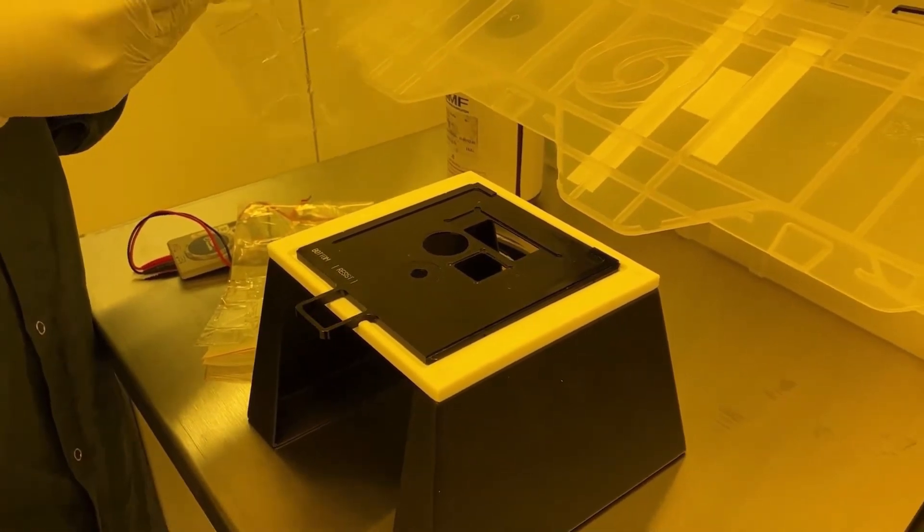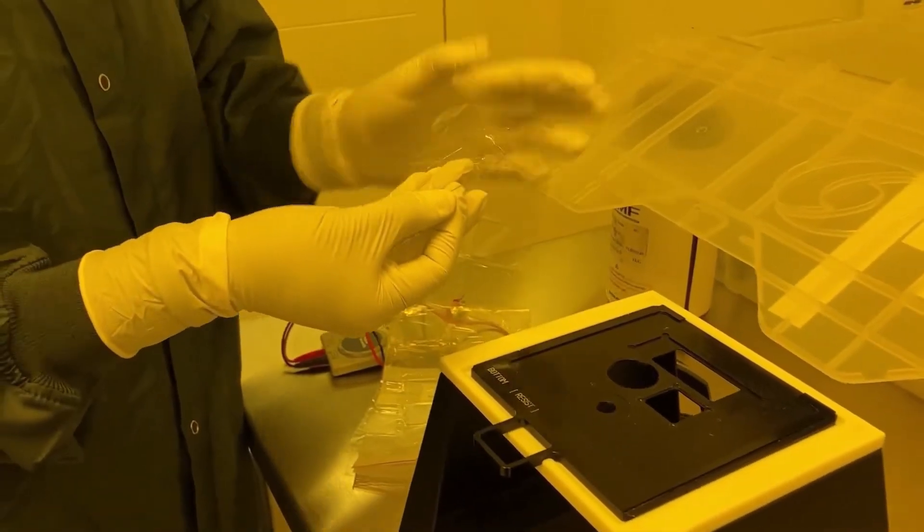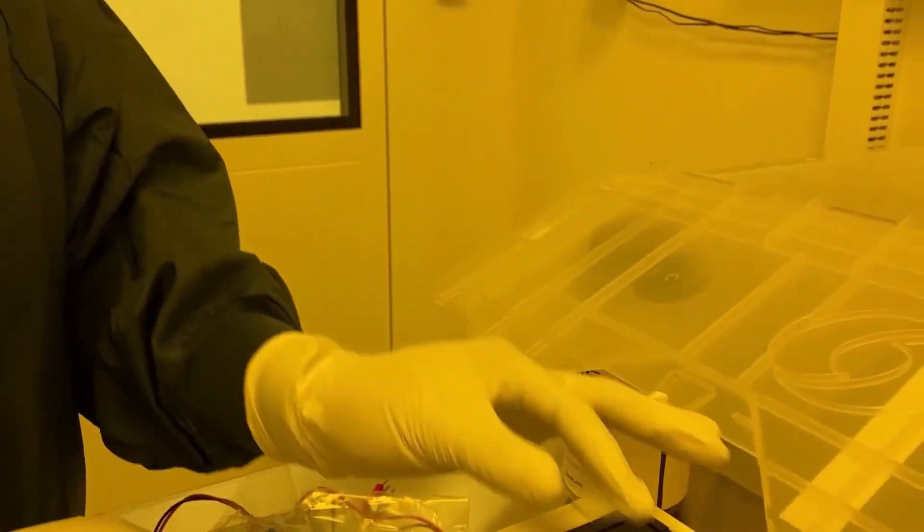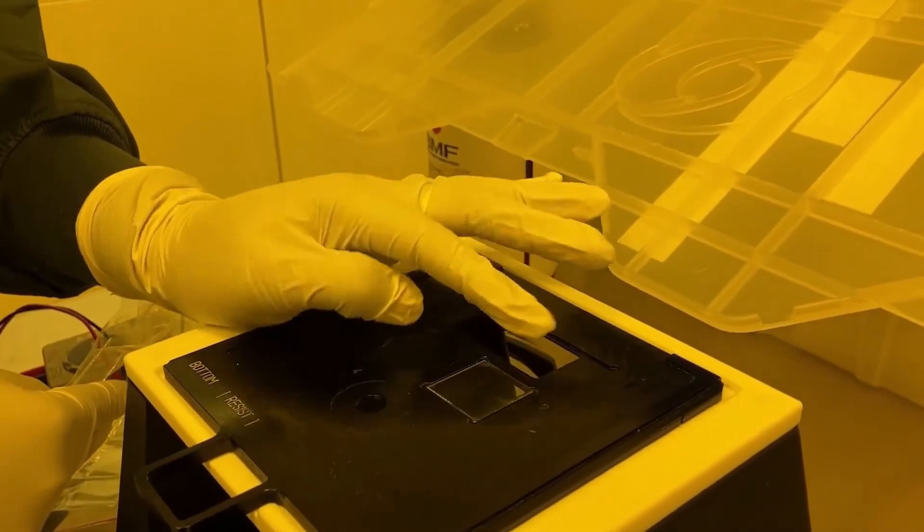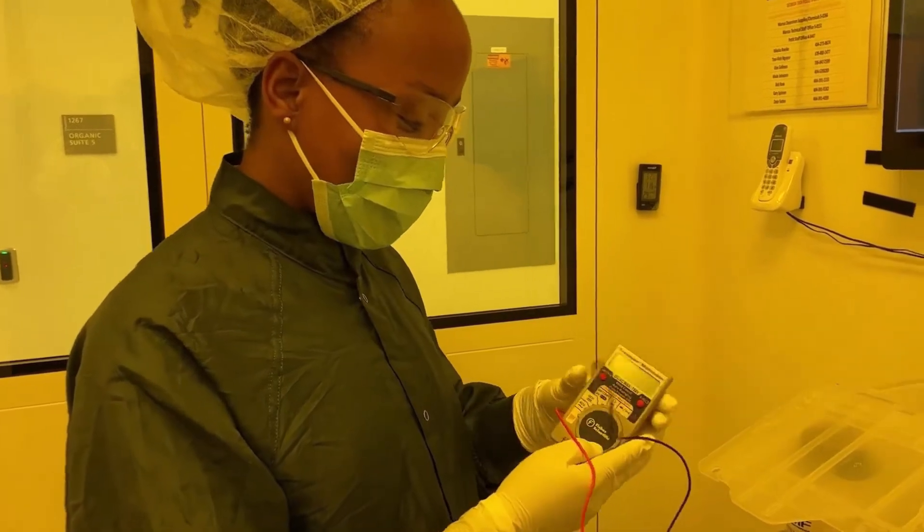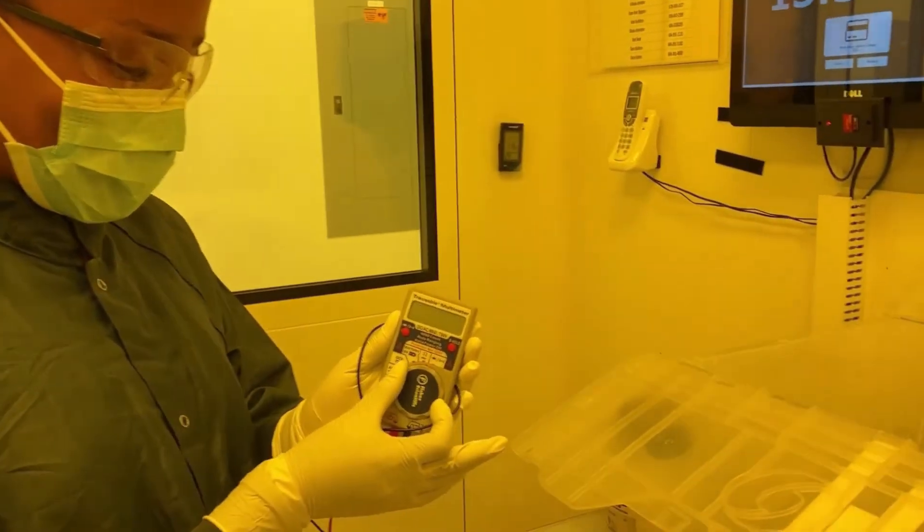Take the substrate and gently place it on the holder. Now you are going to want to turn the multimeter on by placing it on the resistance setting.